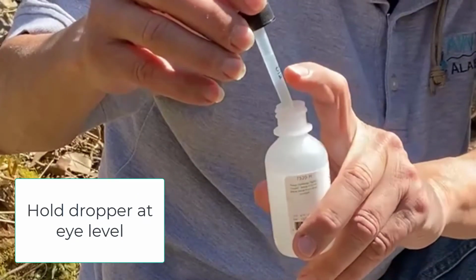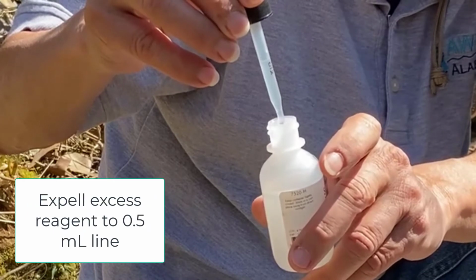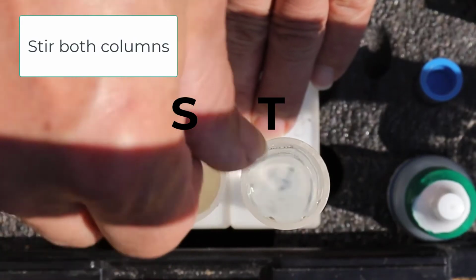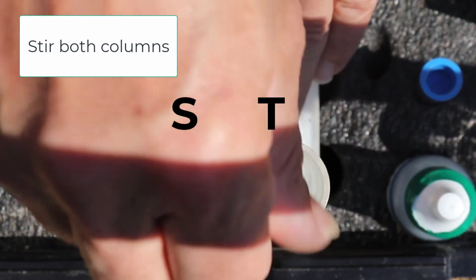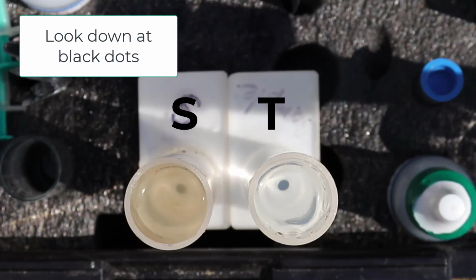Hold the dropper at eye level and carefully squeeze the bulb and expel excess reagent to the desired sample volume marked 0.5 ml. Find the clear stirring rod and stir both columns. Tap off excess water between columns to prevent contamination. We recommend that you hold onto the foot of each column when stirring to prevent spills. Look down at the black dots at the bottom of the columns.